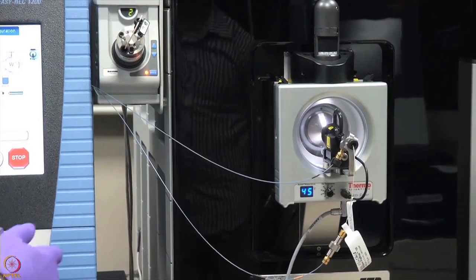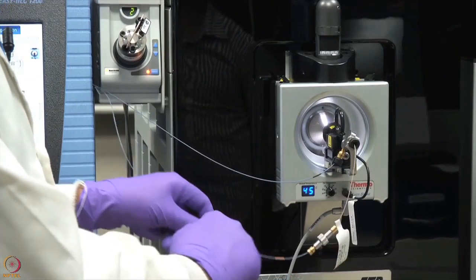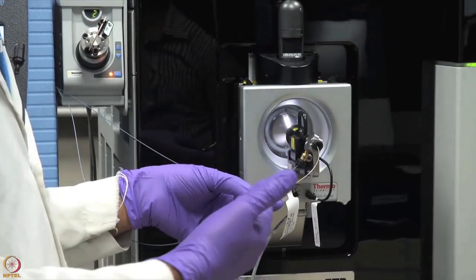Once you have kept your sample in the nano LC, you will monitor it through the software. Your sample will go through this tube, and this is the first column, which is the pre-column, where your sample will start to clean up.